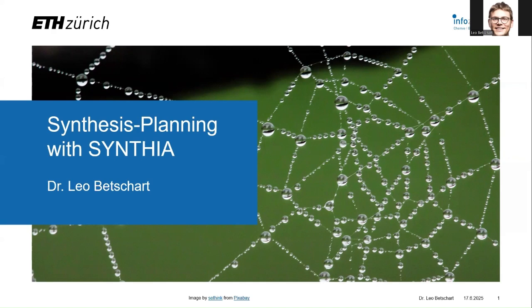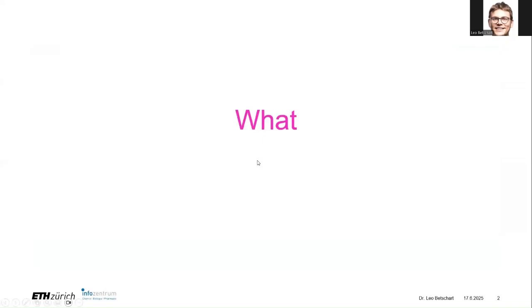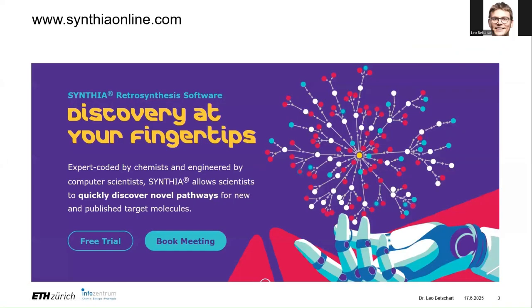I'm an organic chemist by training, and today I will give you a quick overview of Synthia, a new tool we have available here at ETH. So first of all, what is Synthia and what can you do with it? It's an online tool that helps you in planning multi-step organic synthesis and discover new options or also explore different suggestions.